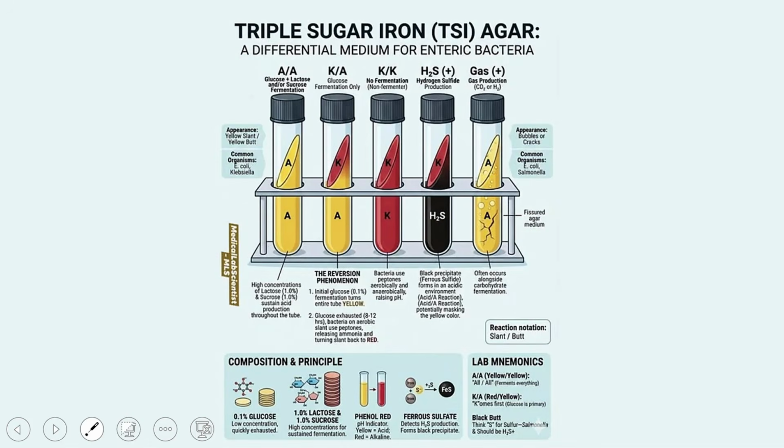So I would like to leave you with this triple sugar iron test result over here for you to go through for more and better understanding.